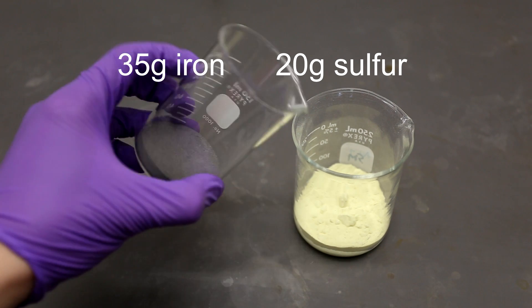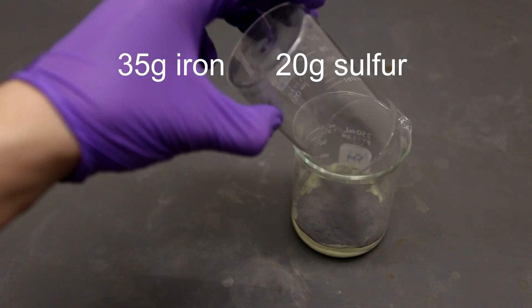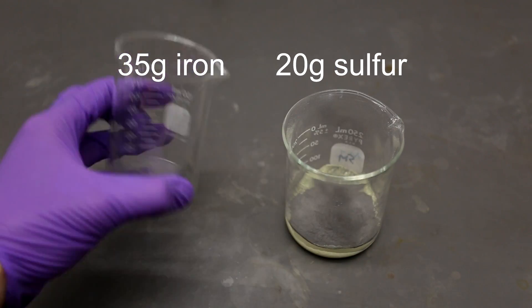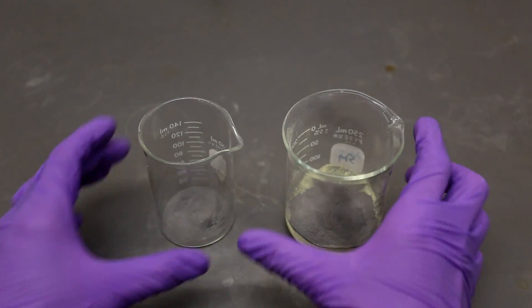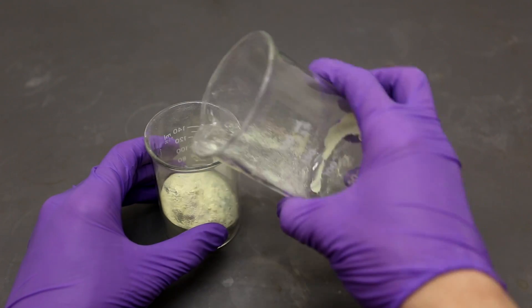First, I added 35 grams of iron to 20 grams of sulfur. I then poured the powder between each beaker back and forth until the mixture became relatively homogenous. When mixing two reactive powders, this is often the best method to use.